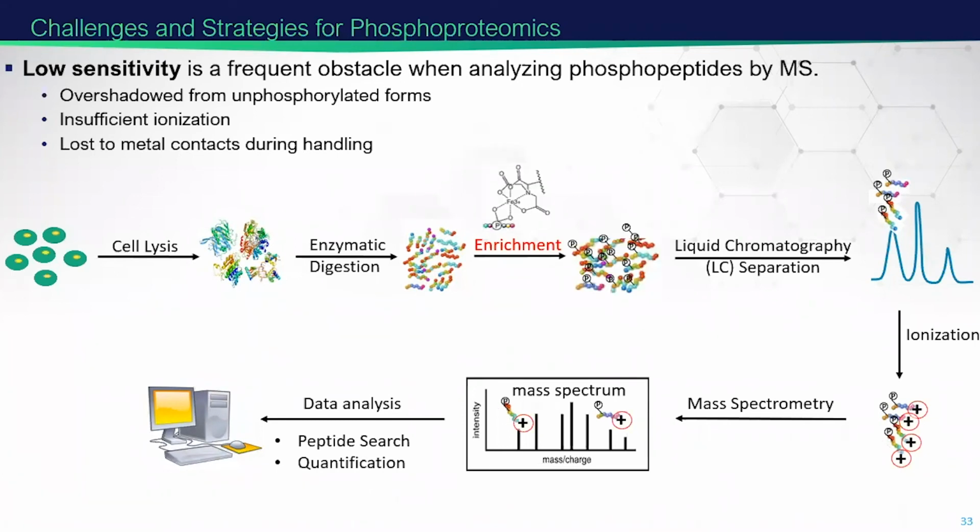If you really want to study post-translational modifications, you need to enrich those peptides out of the non-modified ones, so you can specifically target those phosphoproteins, for example, in phosphoproteomics. There are also many other things you need to consider. For example, phosphopeptides are easy to attach to metal, so in your system, you need to avoid any metal contact with the columns or the electrospray.